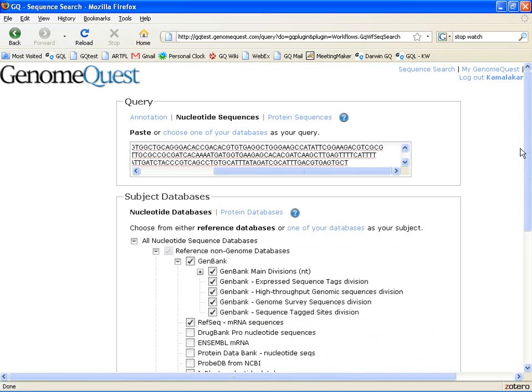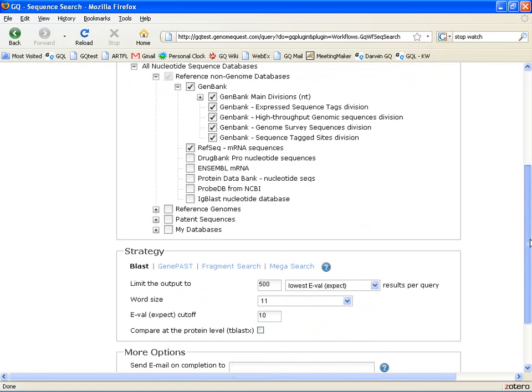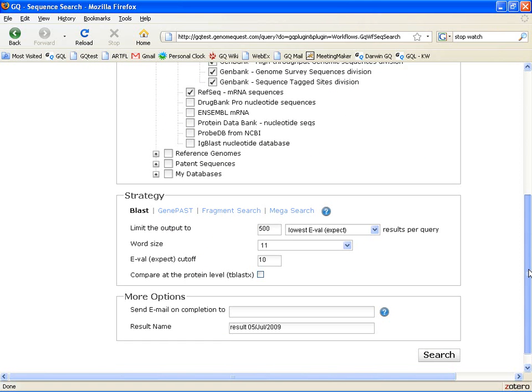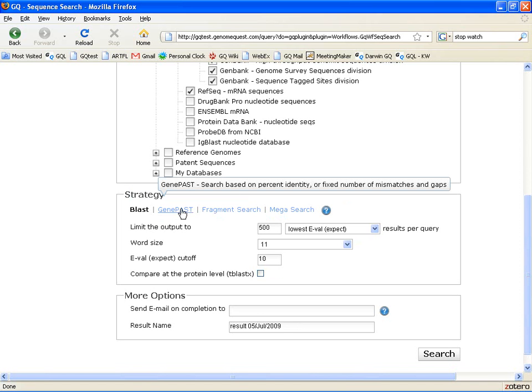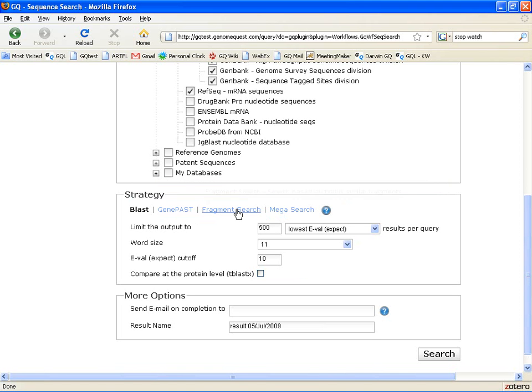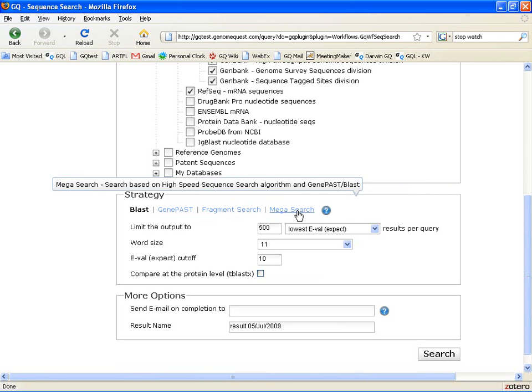The third step is to choose a strategy. We'll choose BLAST in our case, but you could also choose GenePast, which is a global percentage identity search, or Fragment search, which is kind of like a local version of GenePast.